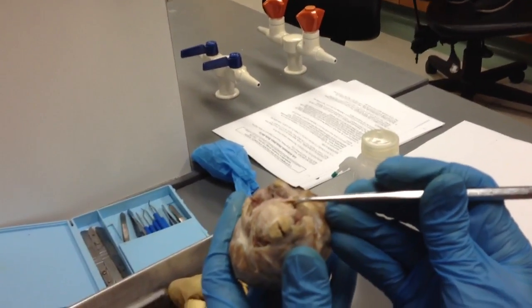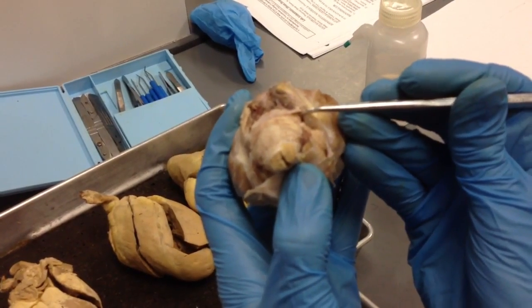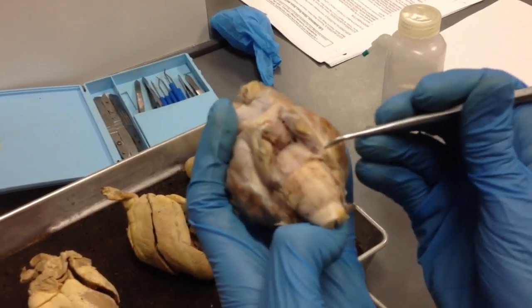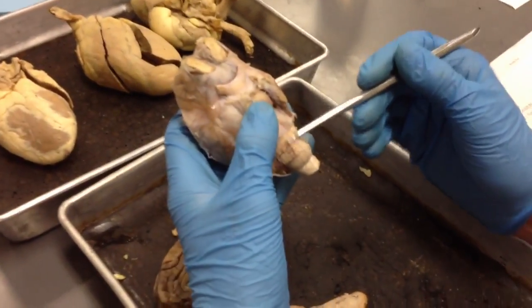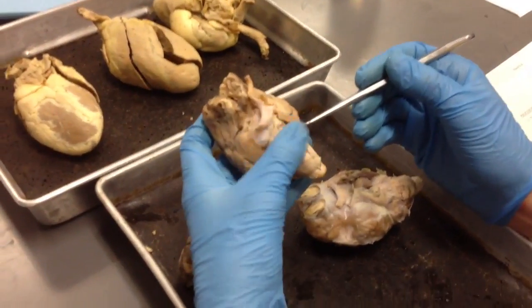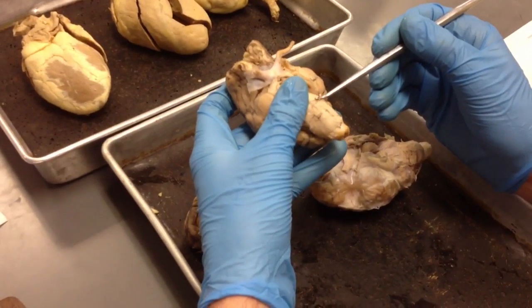Right there at the tip of the pointer is the trigeminal nerve, cranial nerve number 5. So it's a nice thick one compared to the trochlear, which is really small. And then the abducens is the 6th one, which is on the pons. So it's another pretty skinny, narrow one right there.